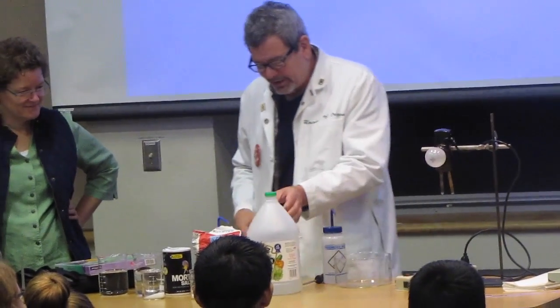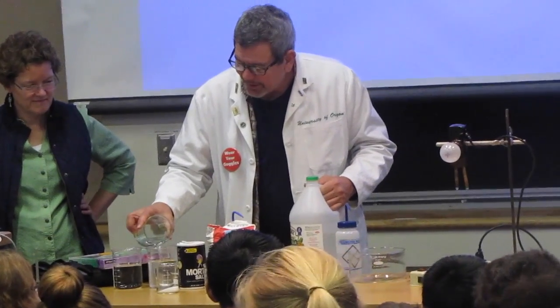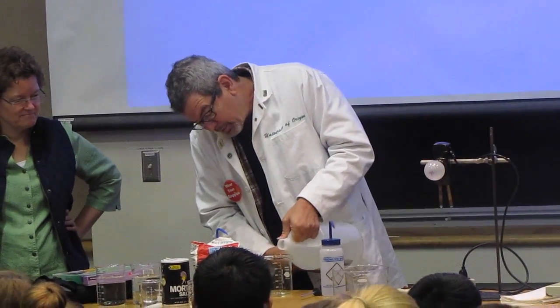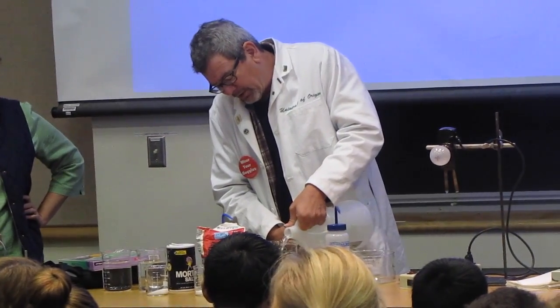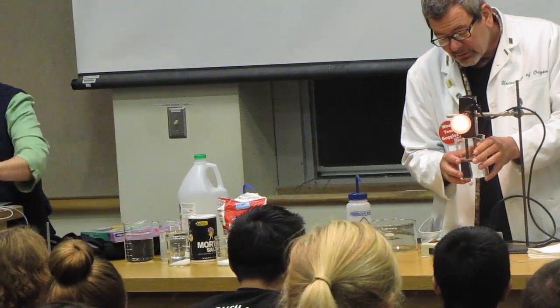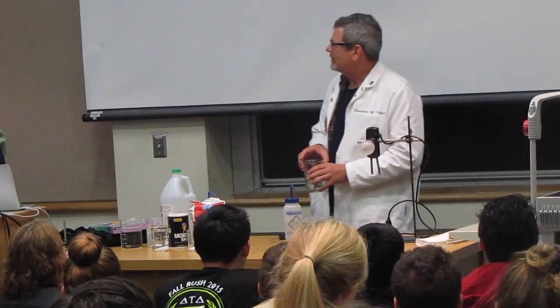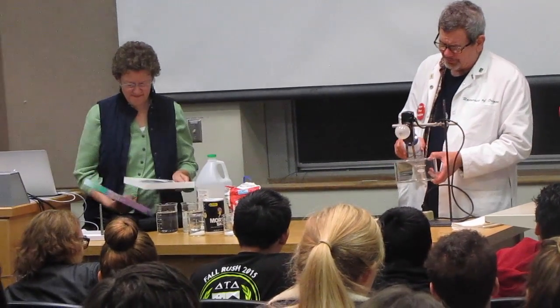Last one. This one is already in aqueous solution — acetic acid in aqueous solution, about 0.8 molar. That's vinegar; white vinegar is almost that. I've got water and acetic acid in it, so this is already a solution. Let's try this. Randy, turn it off. That's an ambiguous result. Did it conduct? Yes. Did it conduct like salt? No — even though it's probably more concentrated.